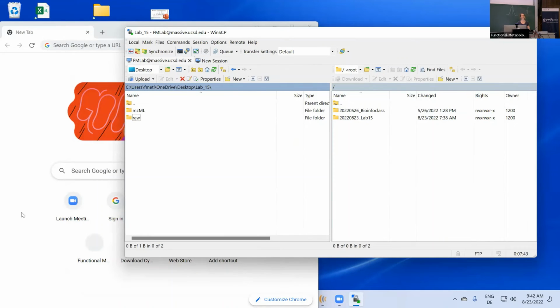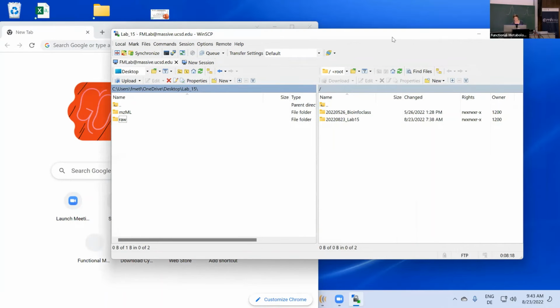Yeah. We just have to watch that, right? Because I'm trying to keep up, but we don't have the files. Oh, the download takes forever. Yeah, good point. So maybe for now we watch, and then maybe during the break, or maybe we'll even finish a bit early and do that right before. Basically, I'll get you the slides during the break so you can have a step-by-step. Yeah, so, all right.